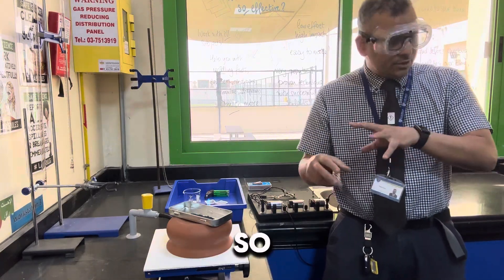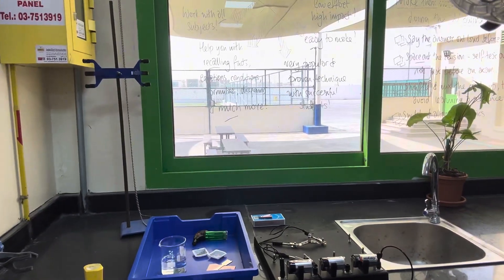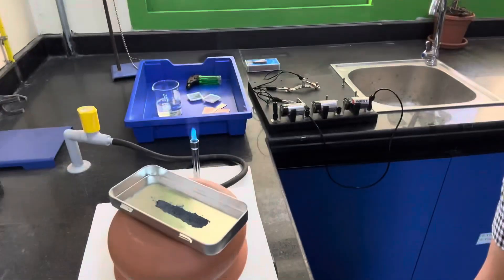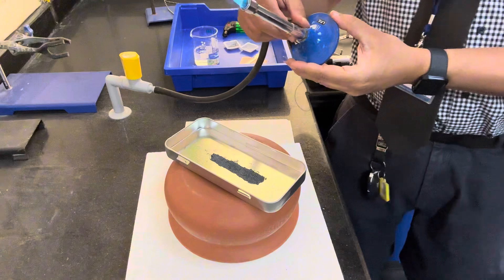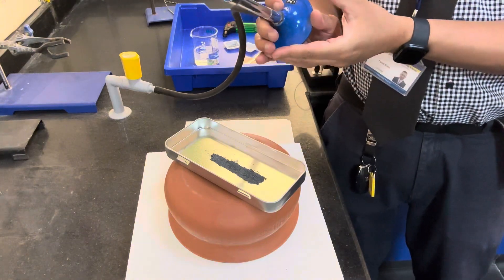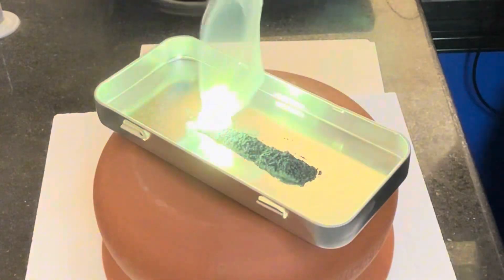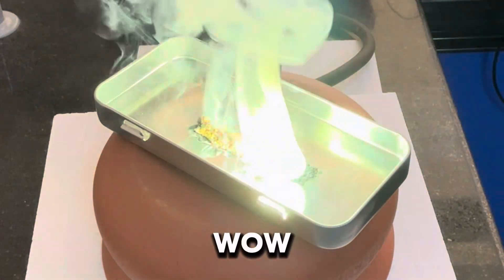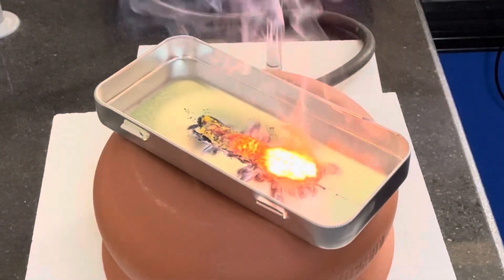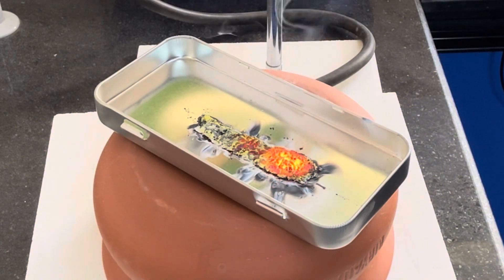I'll bring the camera up so you can see if you're watching on YouTube. Here we go. Whoa! Whoa! Whoa! Whoa! Whoa! Yeah, this is probably going to settle for your arm, which is a big thing. Oh yeah!